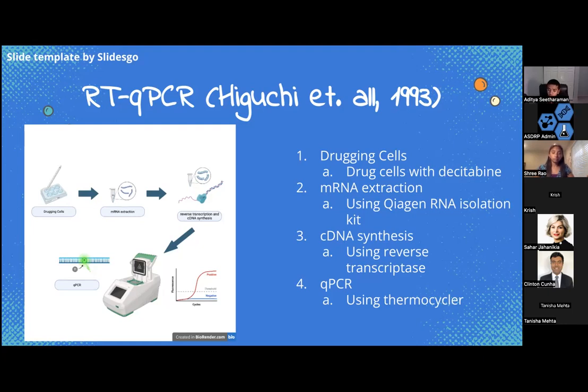Since qPCR works with DNA, the RNA must be converted into cDNA, or complementary DNA, which is why we use the enzyme reverse transcriptase to convert it to a complementary strand of DNA. Next, the specific primer, which is a section of the gene of interest, is added to the mix of cDNA, which binds to the proper areas.